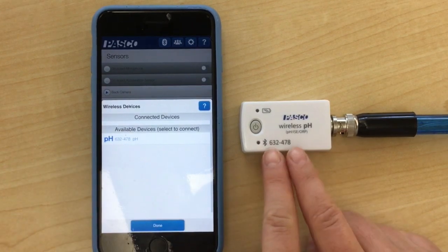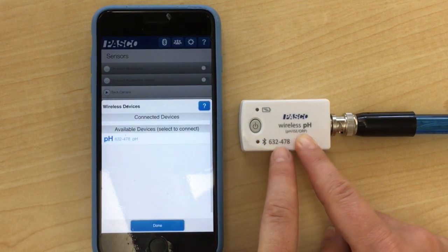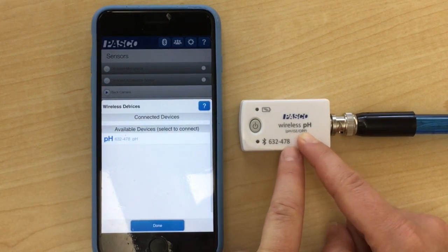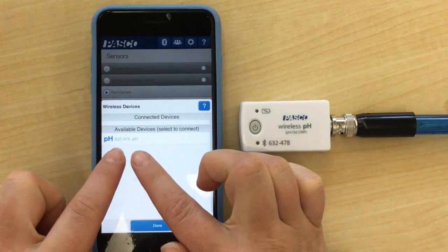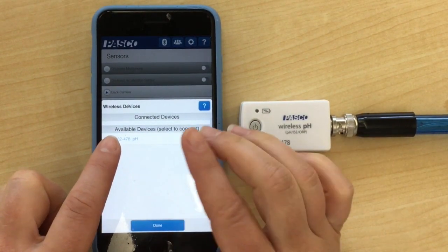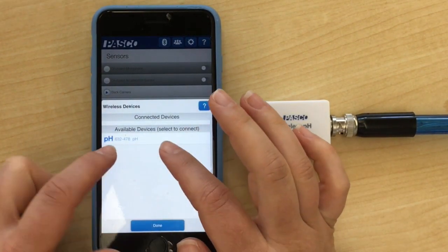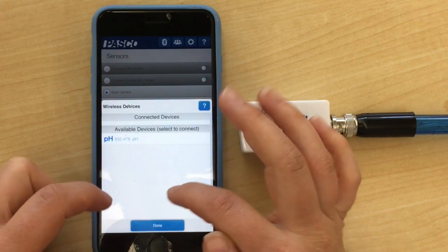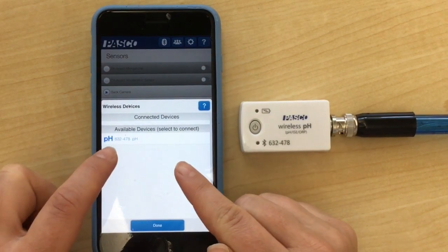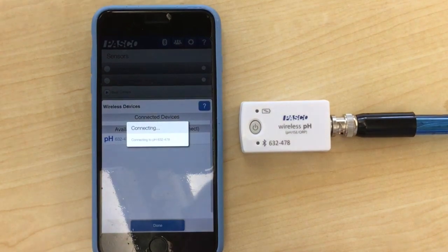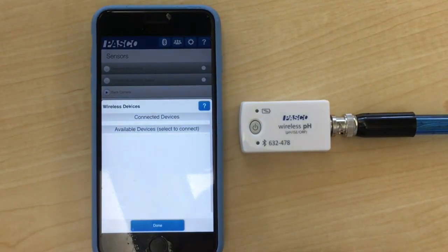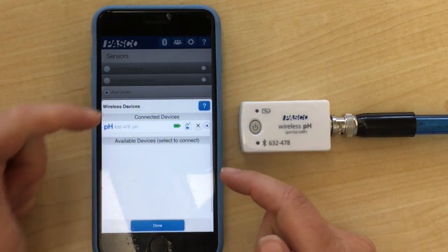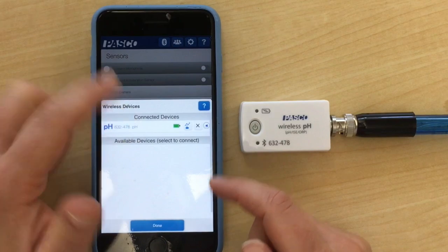My device is 632-478. I'm going to connect to my device. You'll probably see other people's devices in the classroom show up on your phone. Make sure that you're choosing yours. So I click on it and it's connecting, and when it's connected it'll go under connected devices.